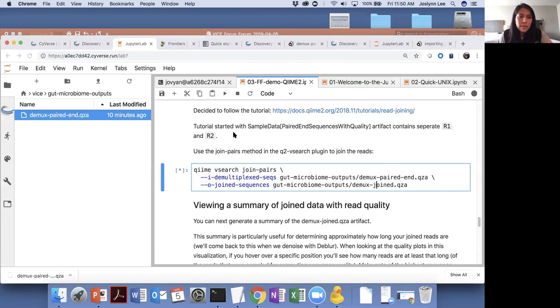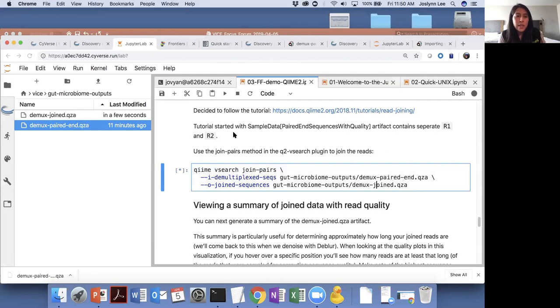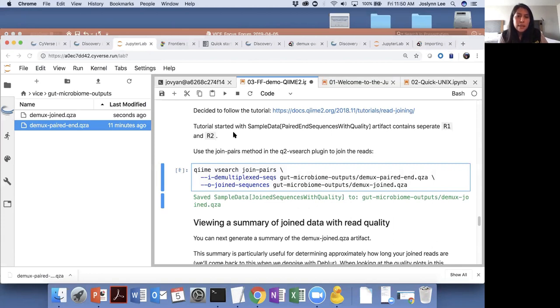I've done smaller amounts on the VICE DE, but there is a limitation that we're trying to figure out how to add more memory for, because one of the biggest problems in running DADA2 is that you run out of memory, since you're constantly aligning and storing temporary clusters of your ASVs. For that, I utilize Atmosphere's cloud computing, and we also have the QIIME software running in JupyterLab on there. I can share that with other folks if they need. It's on my GitHub repo, showing how you would set that up. But yes, DADA2 will take a lot longer. Deblur is a little bit shorter because it's only doing per sample and not per sequence run.